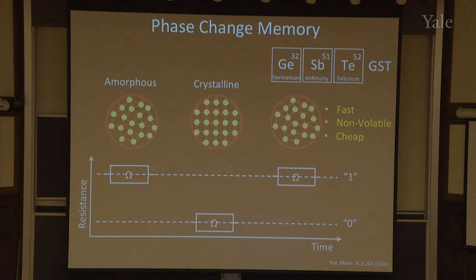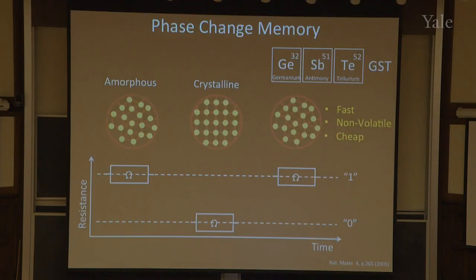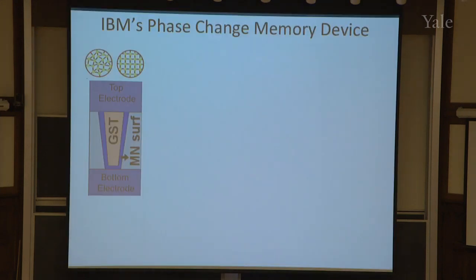So now, maybe this is how we can solve the energy problem. So what do I want to do? I want to actually use TEM and watch the transition between the 2. That's what I want to do. Now, to do this, I work with IBM Watson Center, and IBM Watson Center is about 1.5 hours away from Yale in Yorktown Heights. Okay?